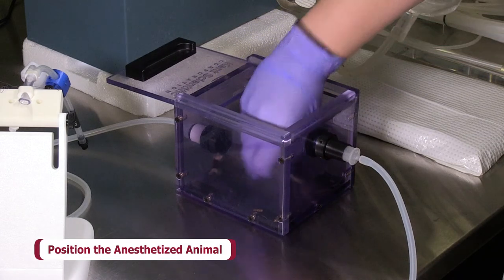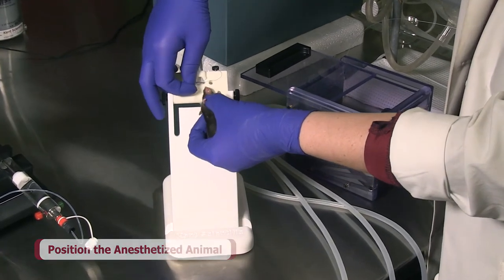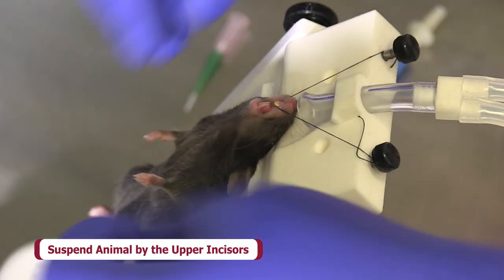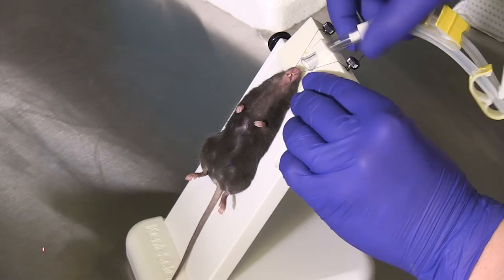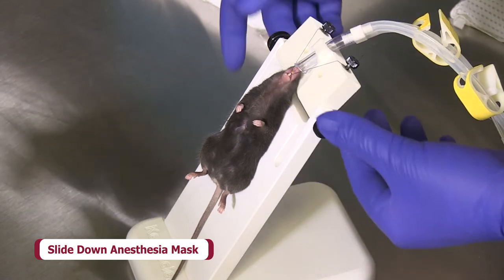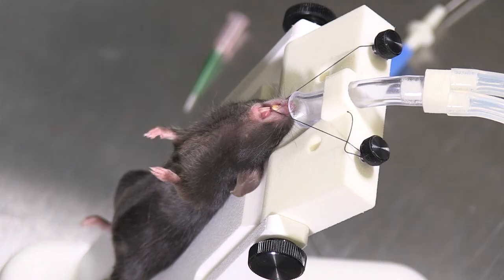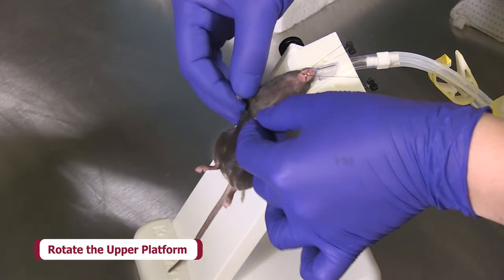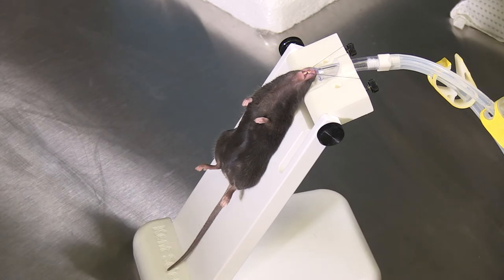Position the anesthetized animal so that the base of the skull is aligned with the rotation axis of the upper platform of the intubation stand. Suspend the animal on the stand by sliding the suture beneath the upper incisors so the animal's dorsal surface is supported by the stand. Slide the anesthesia mask down to meet the animal's muzzle — this will provide a tight fit for anesthetic delivery while still allowing access for intubation. Be sure that the mask is not exerting downward pressure on the animal. Gently rotate the upper platform as needed to straighten the trachea; this movement should mimic natural rotation of the animal's head and neck.